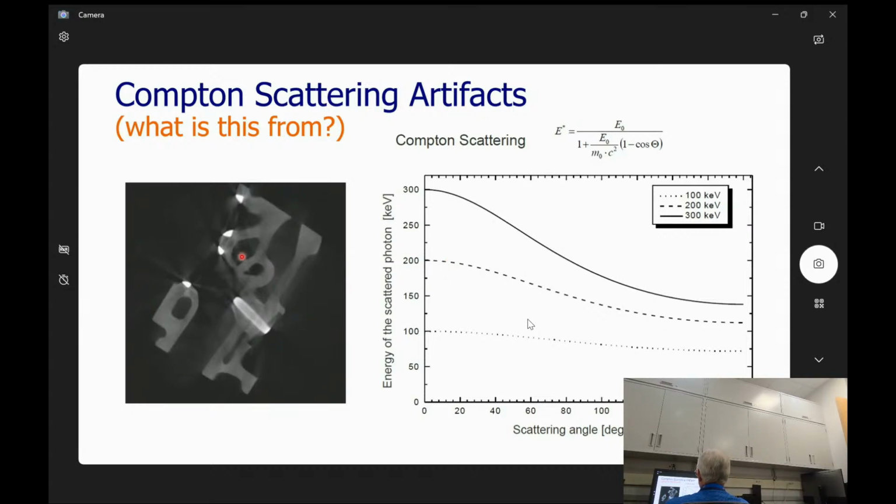But because of this scattering effect, if I've got high density materials and low density materials, and this object spins during the rotation, I have overlaps. So I will have what's called photon starvation, because again, it's self-filtering. I will have concave areas where it becomes very hard to distinguish where an edge is. Sometimes we can overcome that by filling all the voids with something that will absorb those X-rays locally.